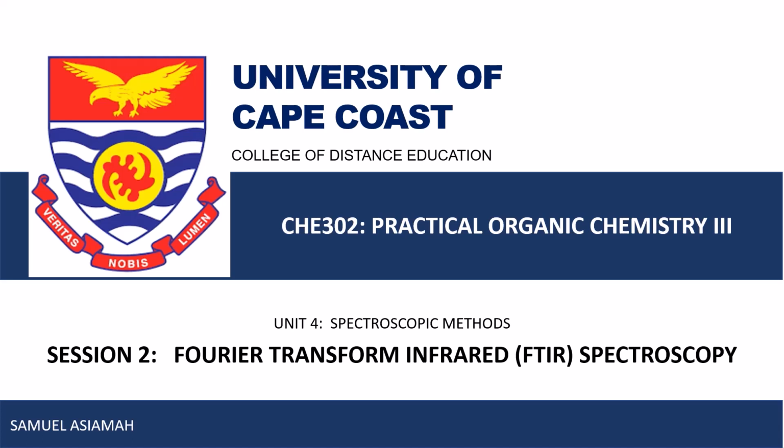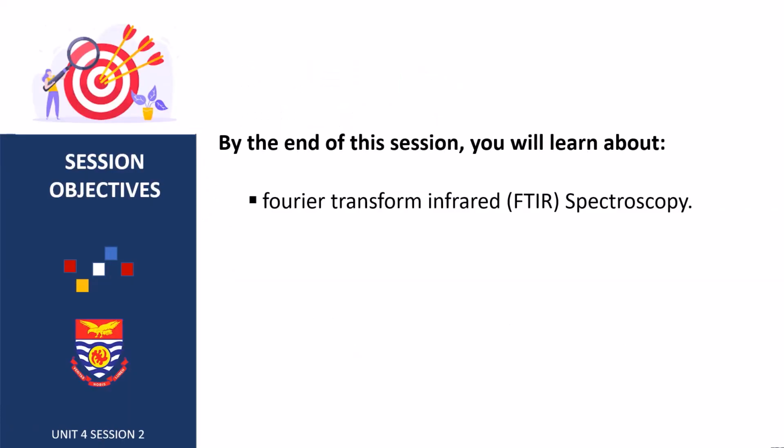Radiation under Unit 4. And in this unit, we are going to talk about Fourier transform infrared spectroscopy. At the end of the session, you should be able to learn more about what FTIR is about.